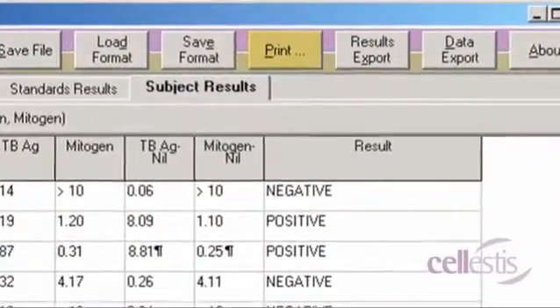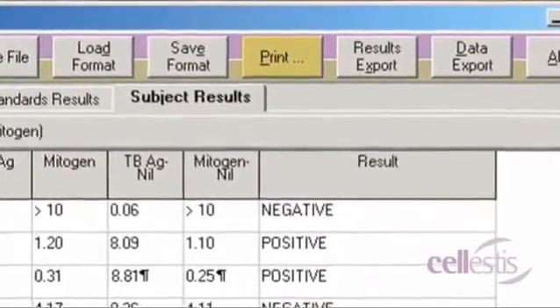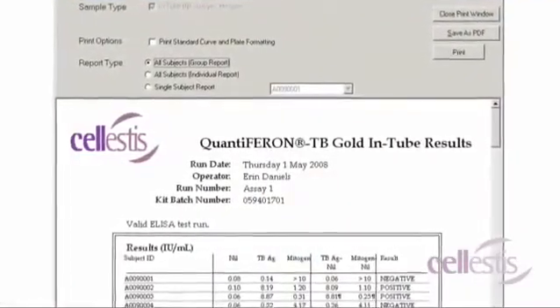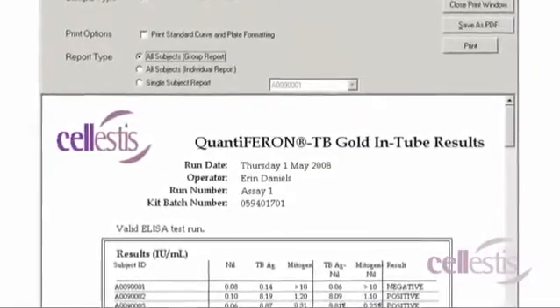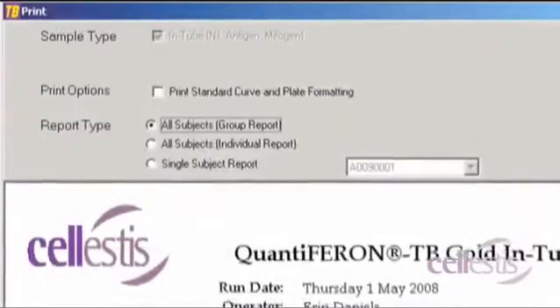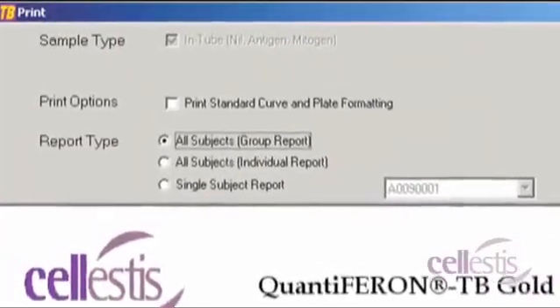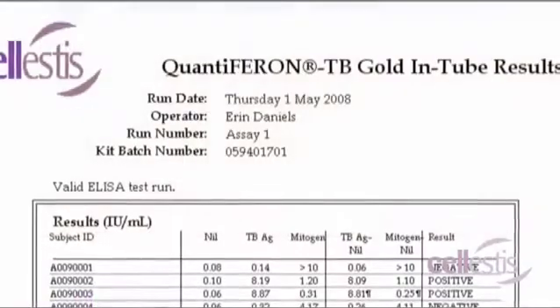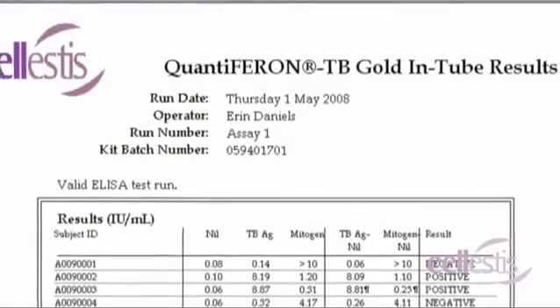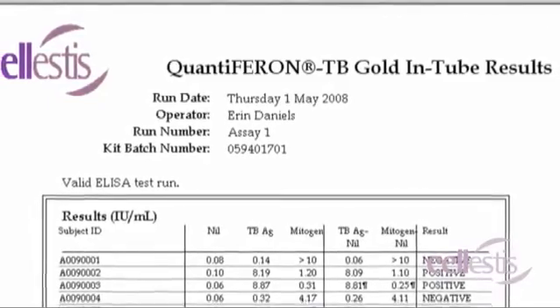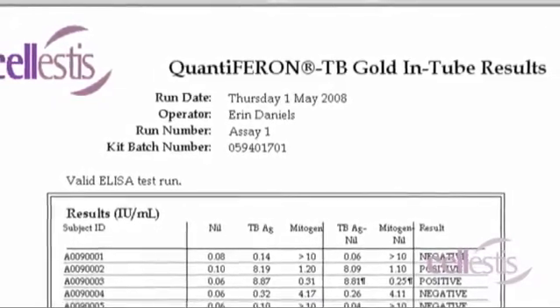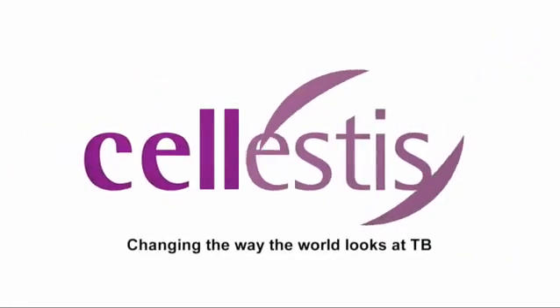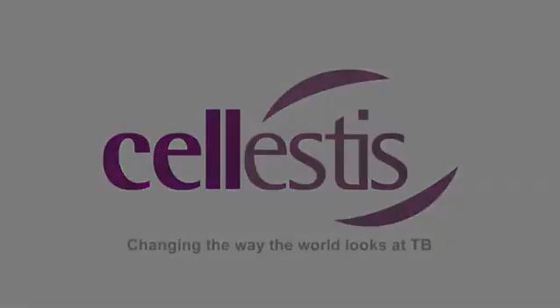To print results, select the Print button. This will display a printing screen that is divided into two sections. The upper section displays the various print options. The lower section displays the ELISA details and results as they will appear on the final printout. Cellestis, changing the way the world looks at TB.